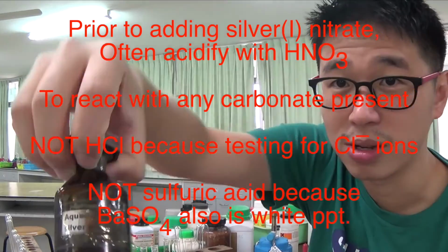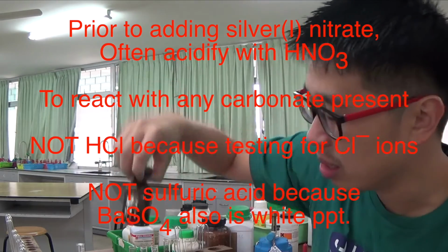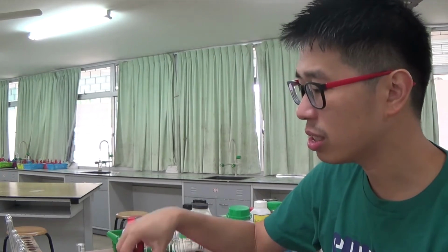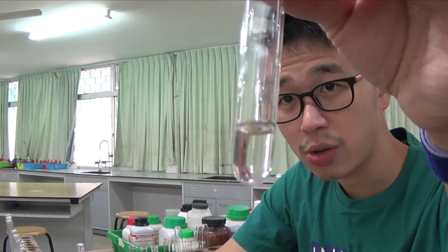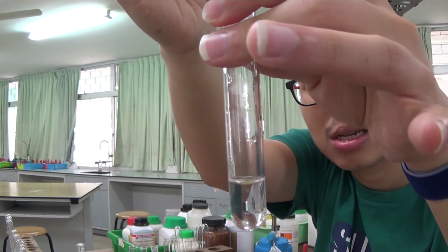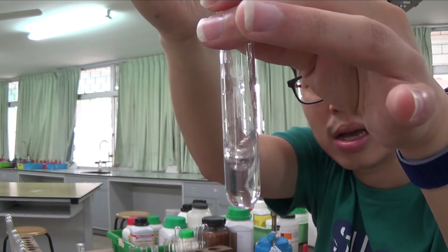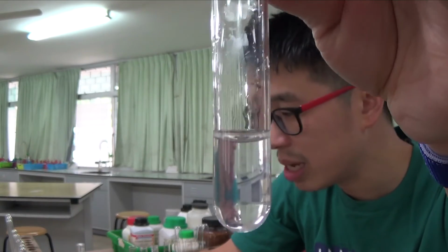This is aqueous silver nitrate. It's not very clear now. It's always contained in a dark container because silver 1 nitrate, silver plus ions, is very sensitive to light. They give you those silver ions. So silver nitrate is used to test for halides. With the nitric acid in there, acidify with nitric acid, then add silver nitrate. You see there is no precipitate.